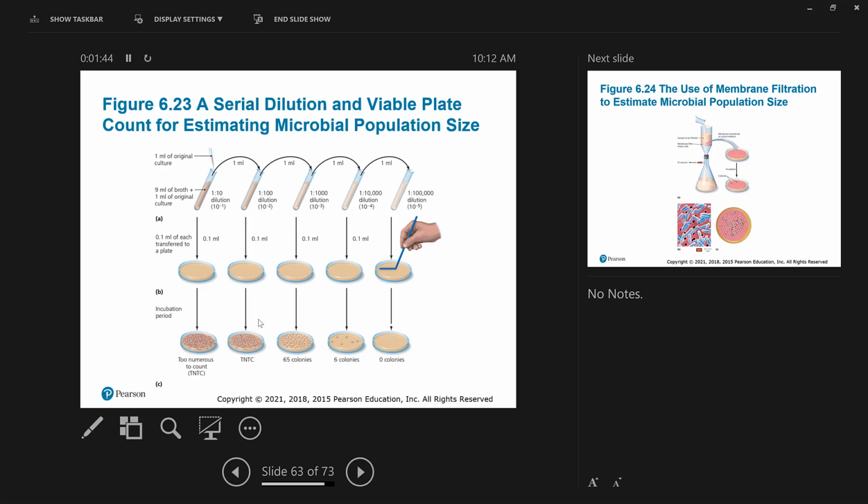In real life, let's say you work for the EPA and you're trying to measure bacterial counts in a local lake. You can't possibly count all the bacteria in the lake. So you take a representative sample, and even that sample will have too many cells for you to count reasonably.